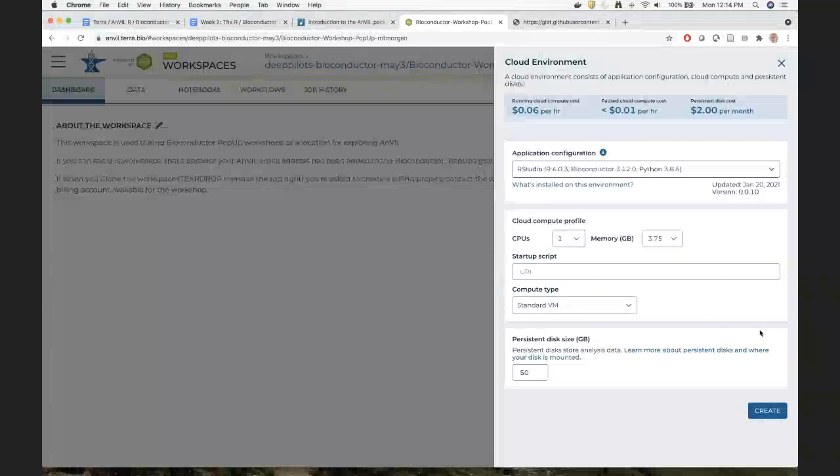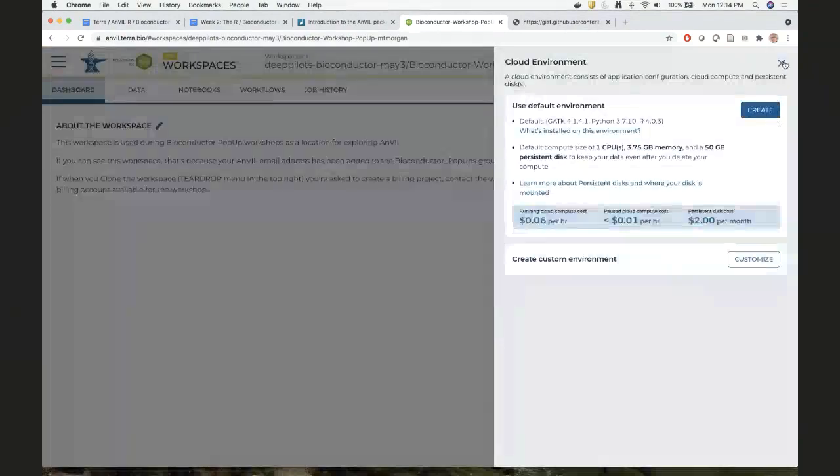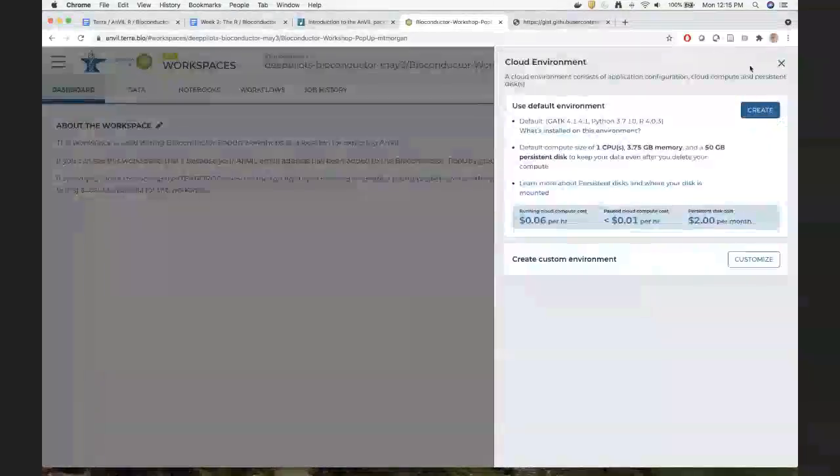Sorry, I just missed you. How did you get to this one spot here? Yeah. Oh, okay. I'm at dashboard. Okay, I'm in the same spot you are now. Sorry. Oh, there it is. Okay, now I see it. It was hidden before with the chat box. Thanks. I see. Cloud environment. And then this customize.